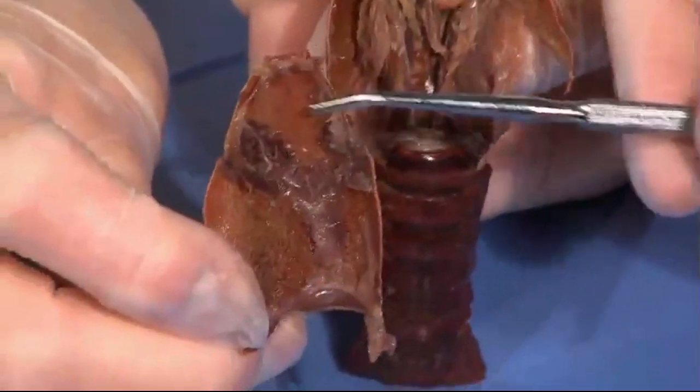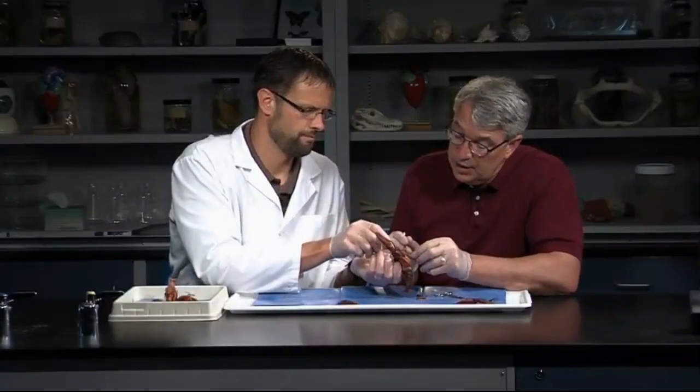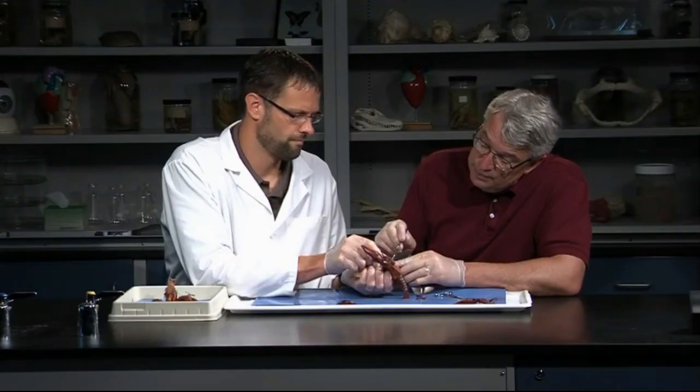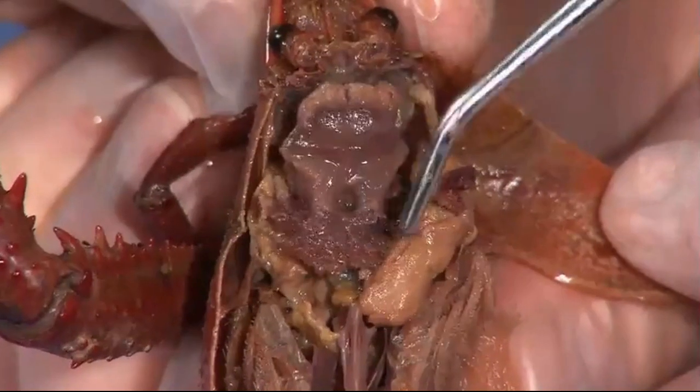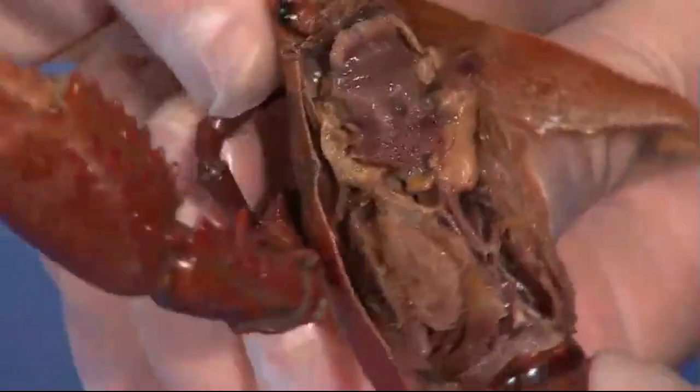There are some muscles attached on there — these are like the muscles that run the jaws, and many of the appendages are still attached on there. These are the stomachs down here. Kind of push those back down a little bit. You're saying stomachs, more than one stomach? Yeah, they have two-chambered stomachs. Let's turn them to the side here just a little bit.